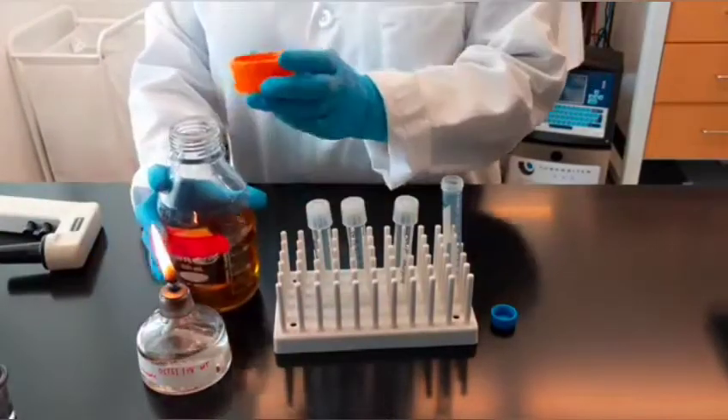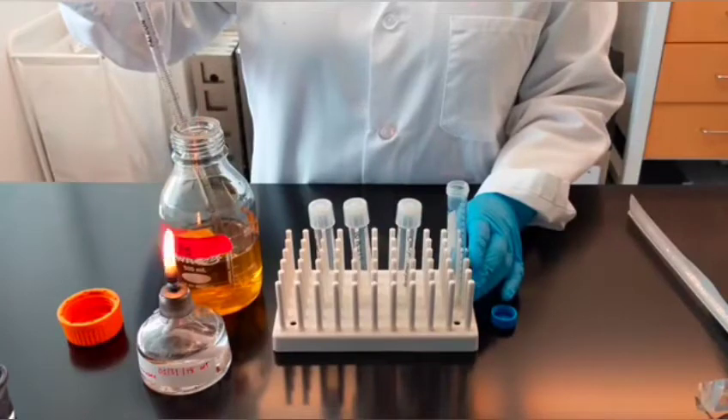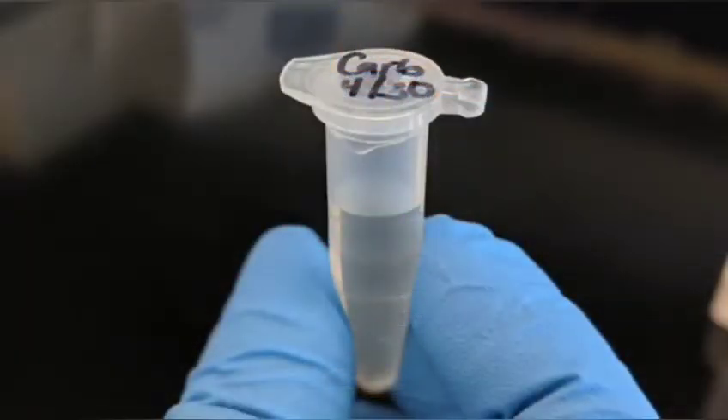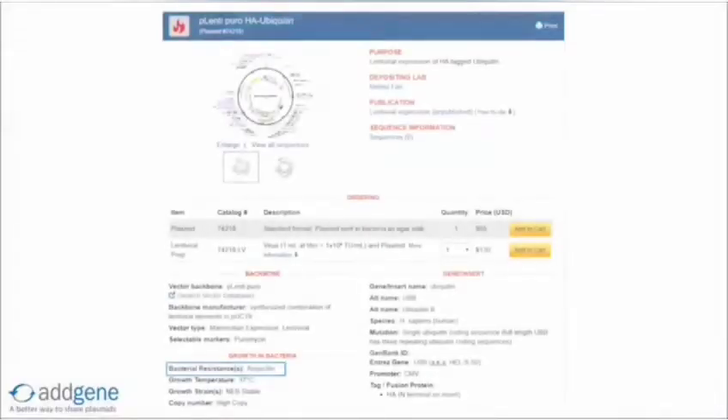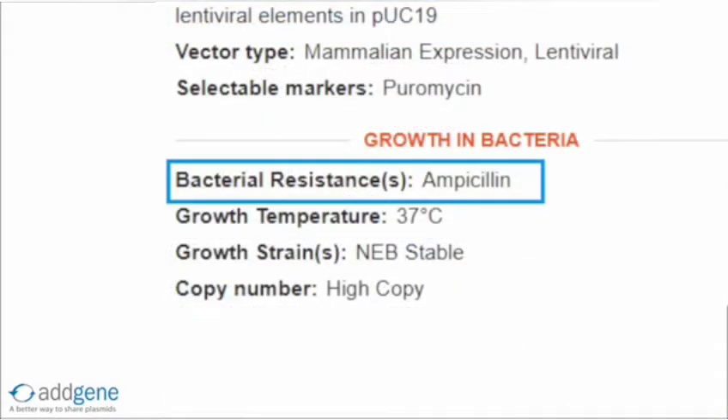First, you will need to prepare your liquid growth medium. We usually use Luria broth, or LB, as it is the most widely used medium for bacterial culture. If your media does not contain antibiotics yet, you will need to add the appropriate antibiotic before proceeding. For any plasmid requested from Addgene, the antibiotic resistance will be listed on the plasmid page under the Growth in Bacteria section.